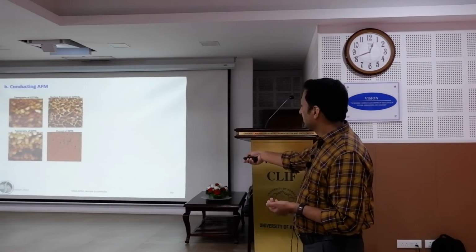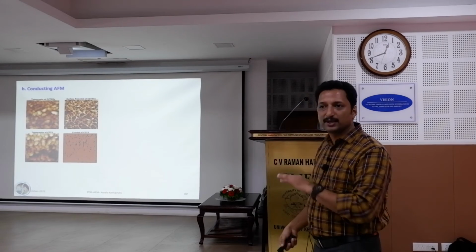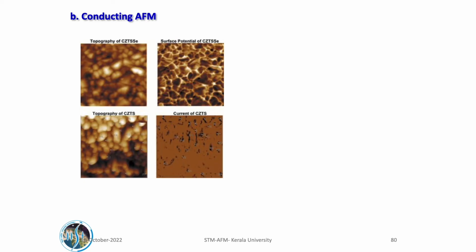Yeah, it's another material, and here you don't see that much variation, which actually means that all the grains are equally conducting. Okay, more or less uniformly conducting.